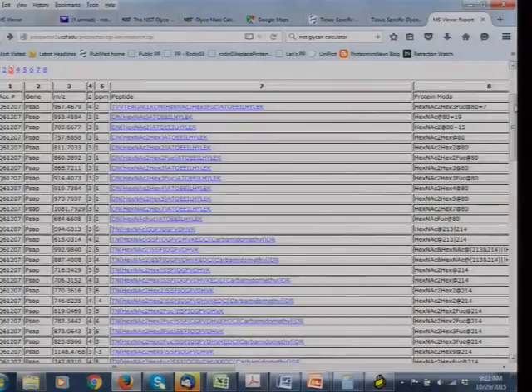Yes, I was being very lazy with the decimal points on there. Depending on the mass spectrometer, this will determine how accurately you're measuring those things. All of the masses we've got here are actually correct to within something like 10 parts per million. What's that in real terms? If something has a mass of 1,000, it's going to be correct to 1,000 plus or minus 0.01 Daltons. So we're measuring them very accurately, and it should be correct to 2 decimal places.